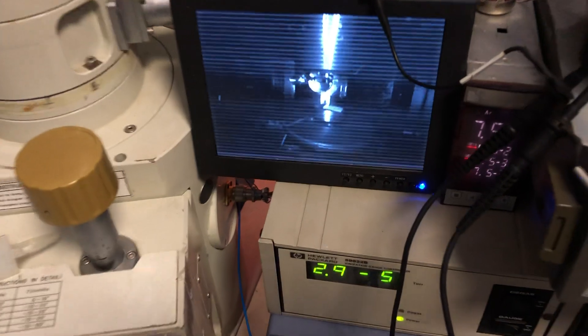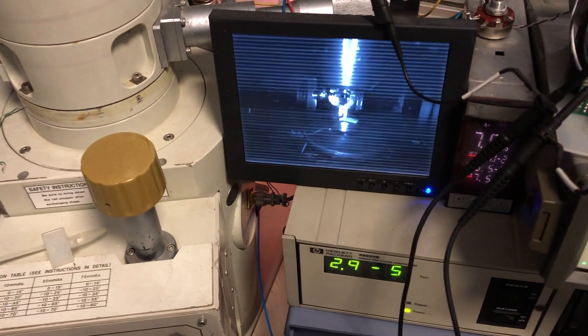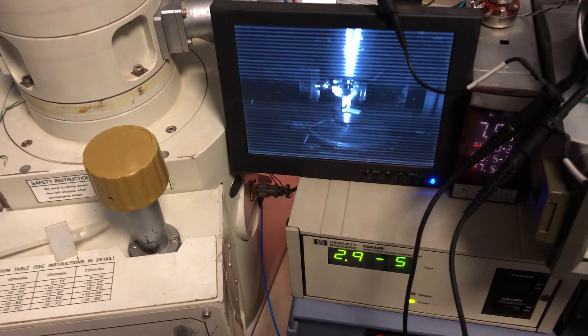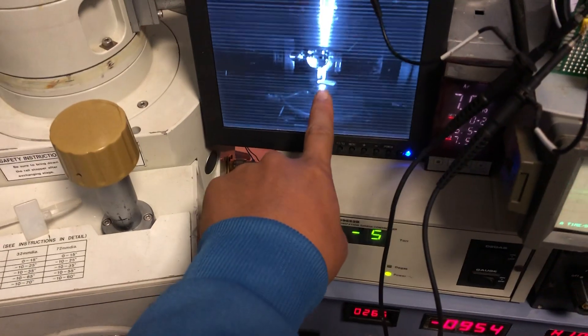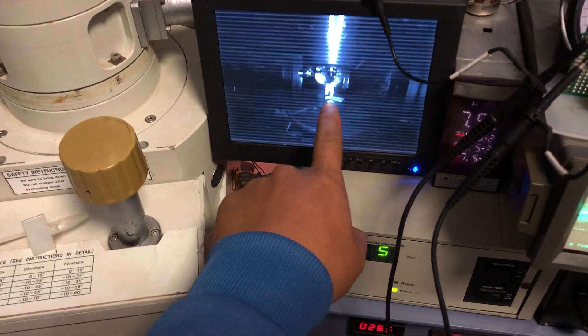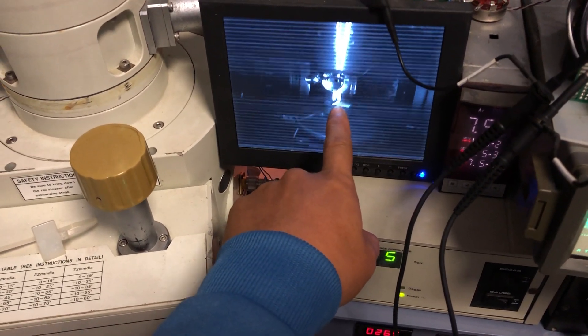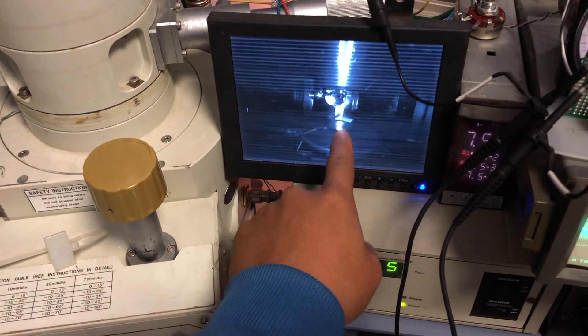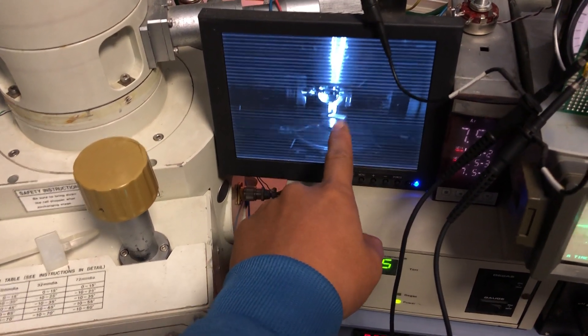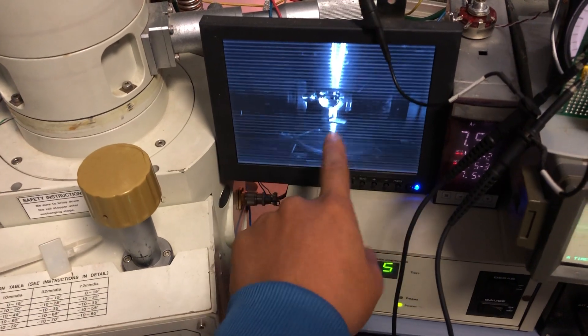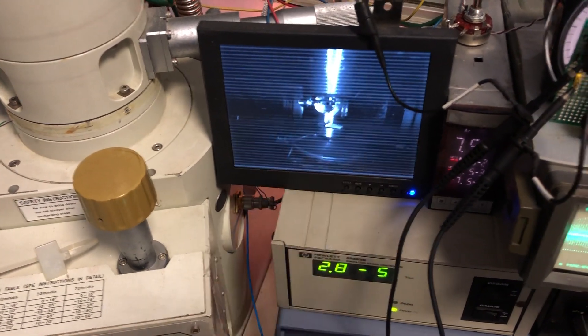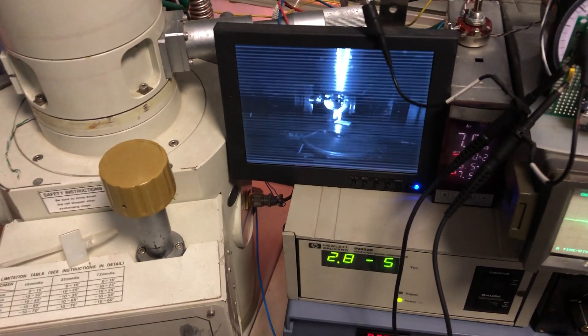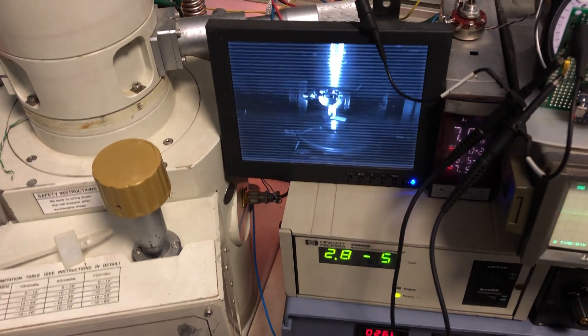Now you can see the electron beam is scanning on the phosphor disk. So you can see the white dot. It's actually the blue dot inside the phosphor disk, but it's a black and white camera so you can just see white.